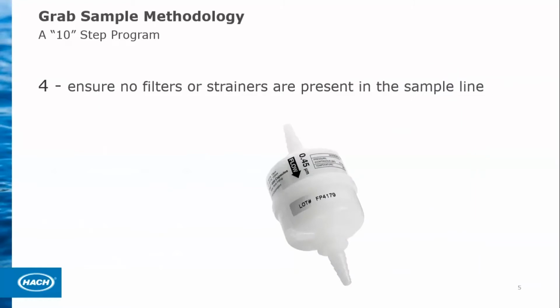This one here might seem obvious, but it's not always obvious. Make sure there's no filters or strainers in your sample. I was at a site once, we're getting very low iron readings, in fact, too low, almost non-detect, and I said, this just doesn't sound right. Well, they went back and they looked and they found out that they had a filter right before we were sampling. So as obvious as this is, ask the question, double check, because if you're filtering out what you're trying to measure, you're not going to get a good sample.